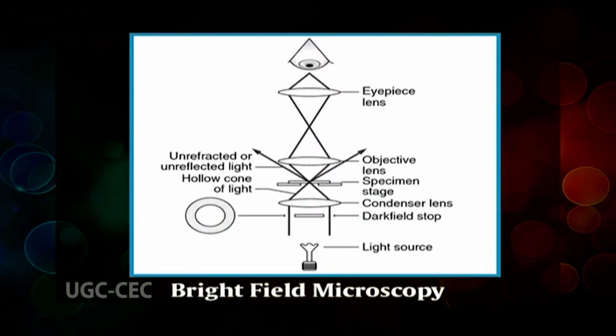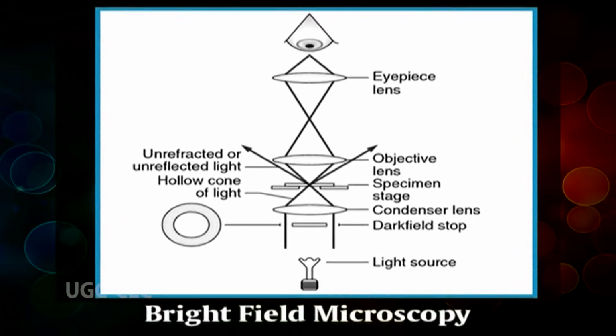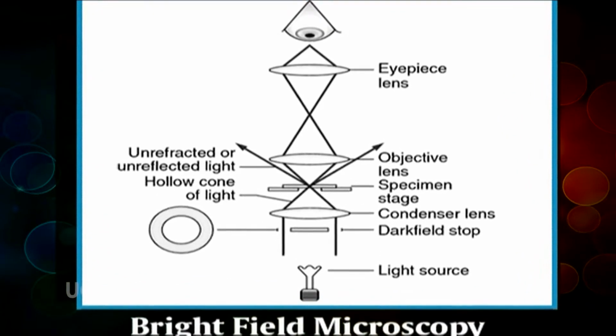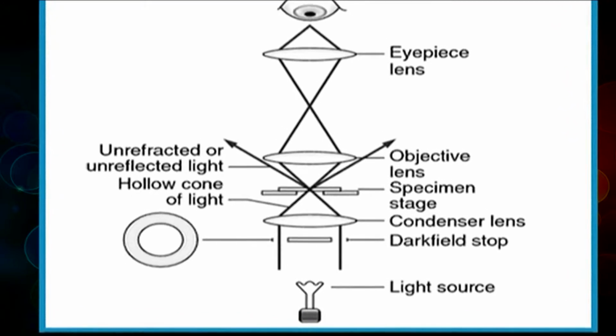Dark field illumination is provided by either a simple patch stop, a dark field element in a phase contrast condenser, or a purpose-built dark field condenser. The latter is required for high-resolution objectives to prevent the oblique rays entering the wide aperture of the objective. Applications include detection of microorganisms in unstained smear preparations and classical diatom studies.